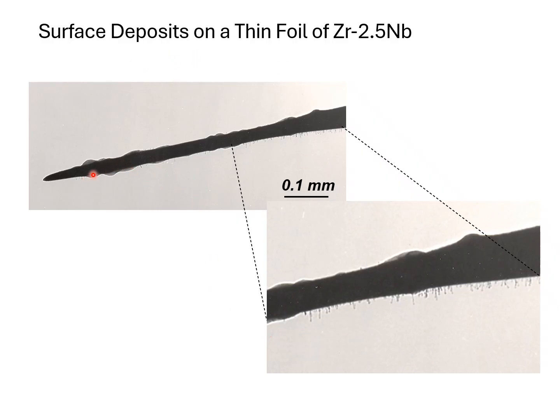Ross made a thin foil, tilted it so far on edge, and set up the imaging conditions in the microscope so you could actually distinguish the deposits. Some are flatter, but on this surface they're more stalagmite type.